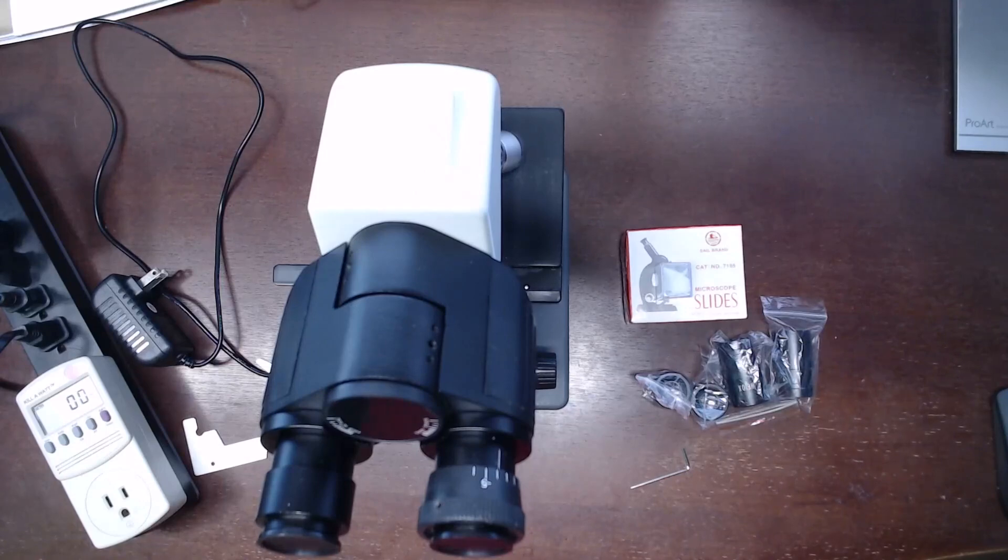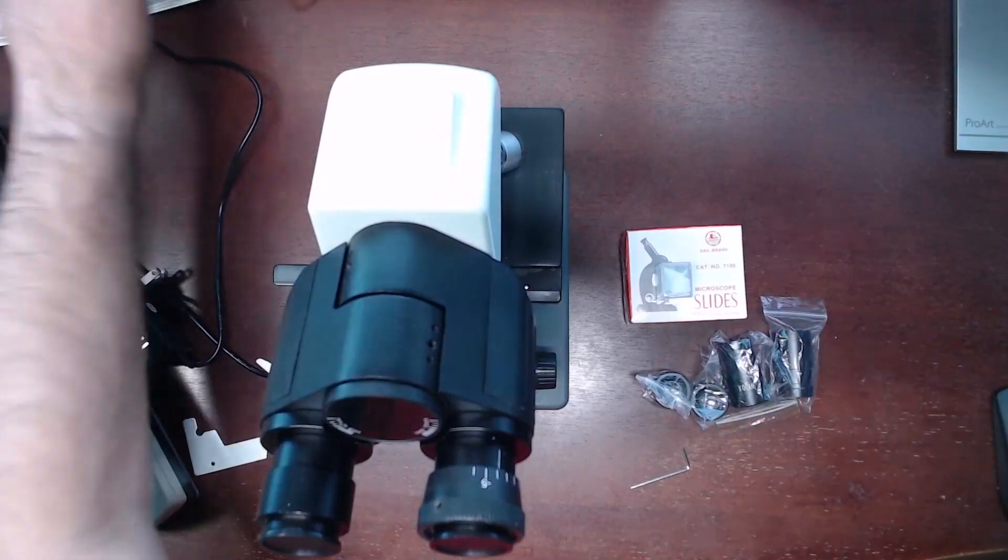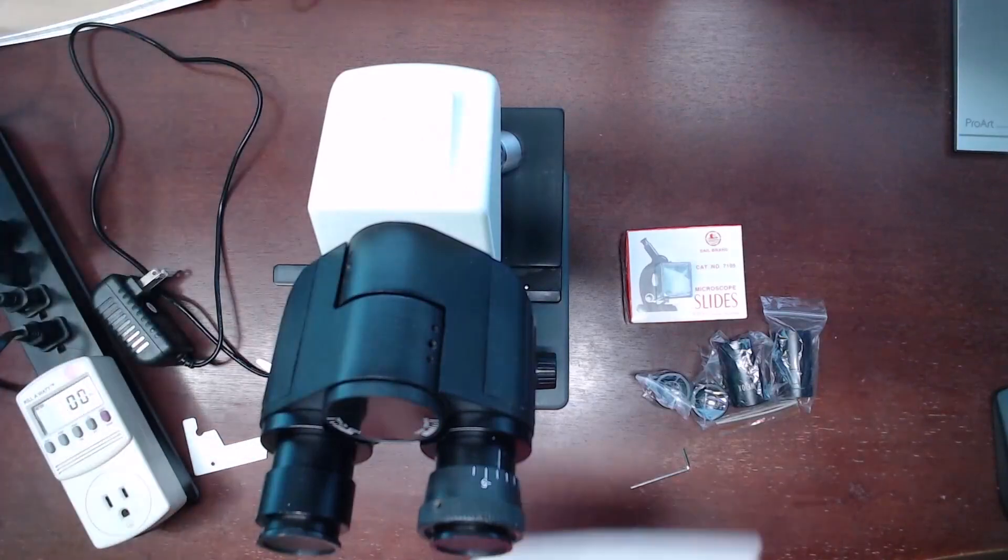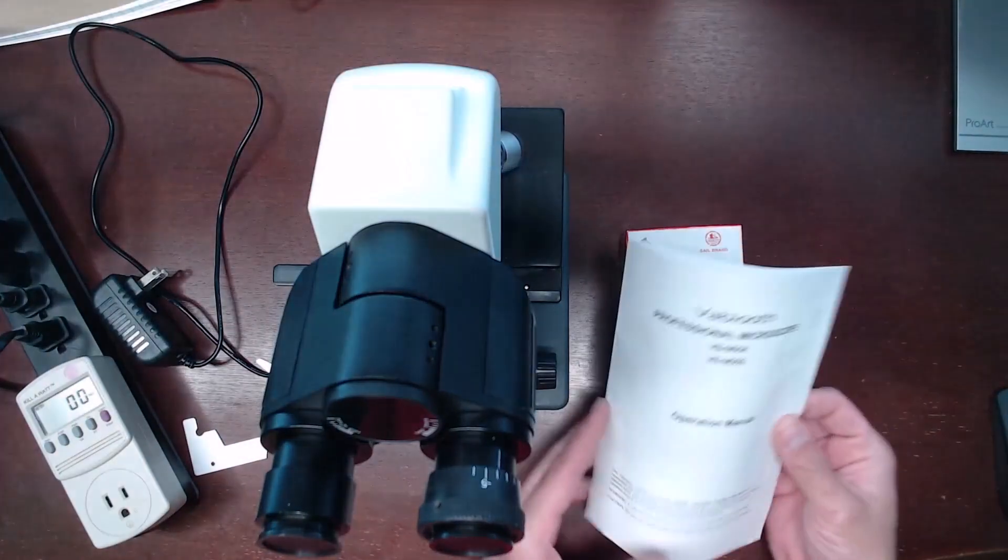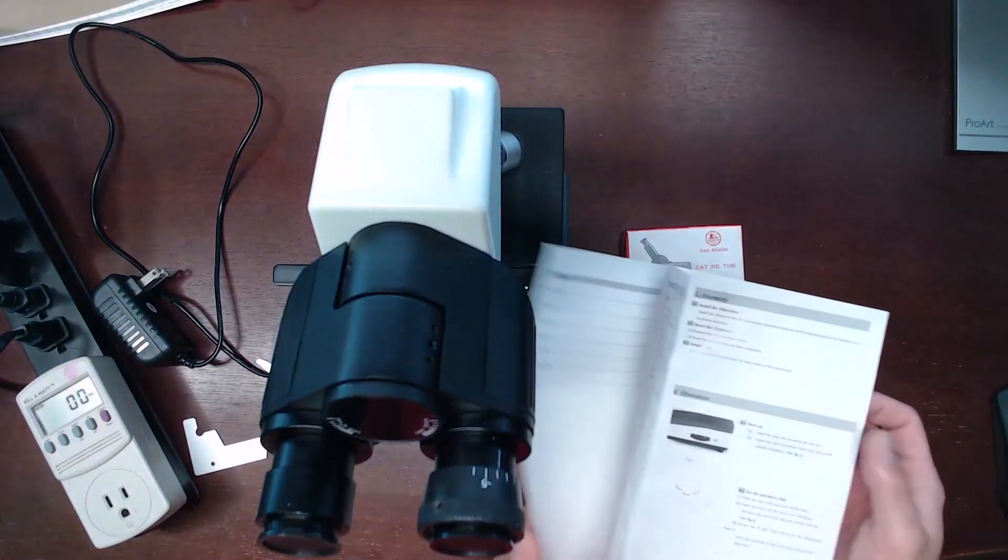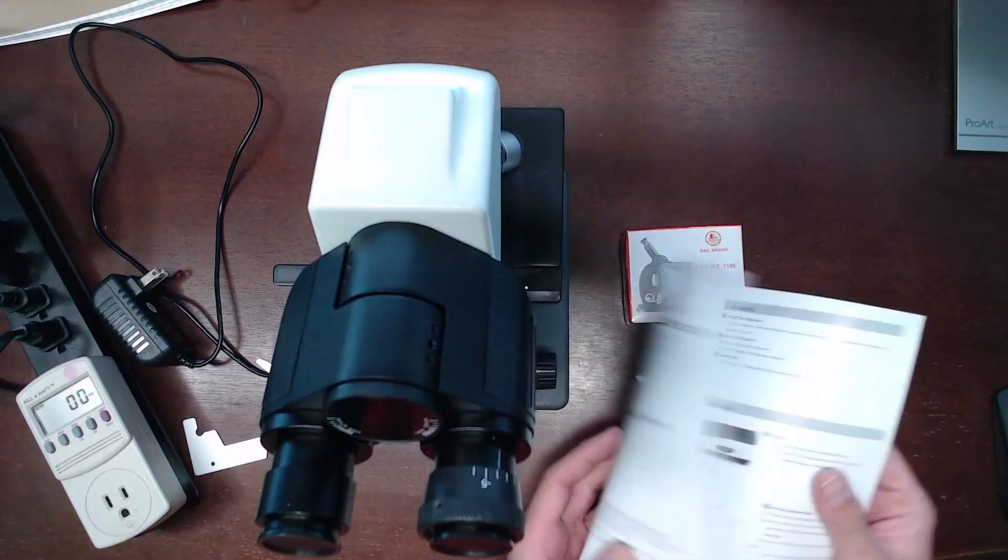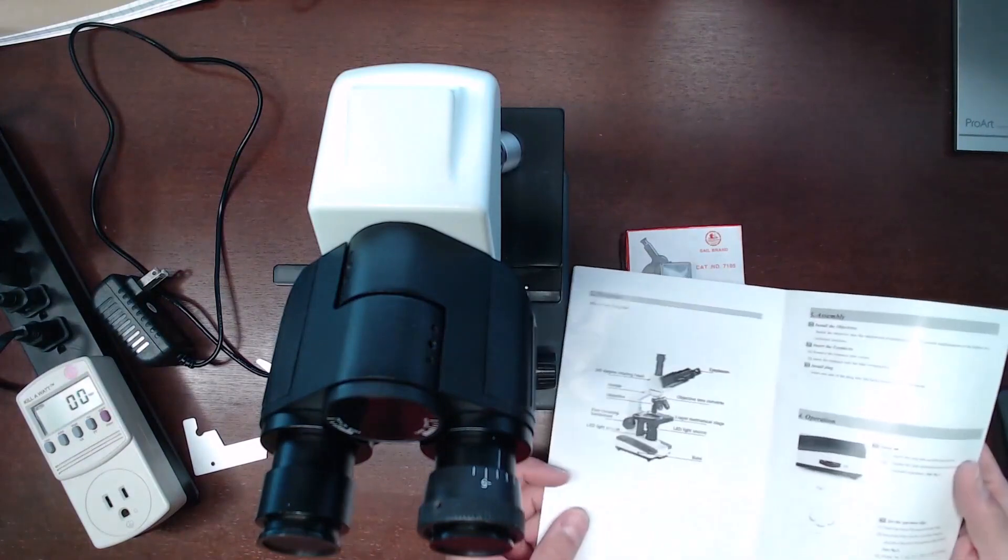There is an instruction booklet that seems more of a general guide than a specific guide, as it does not exactly depict the model that I received.